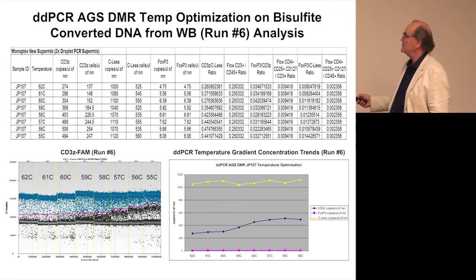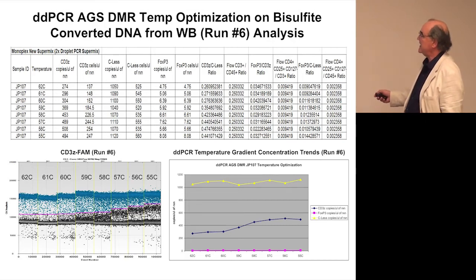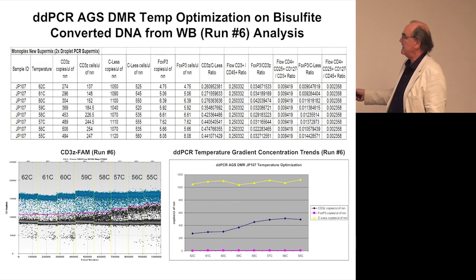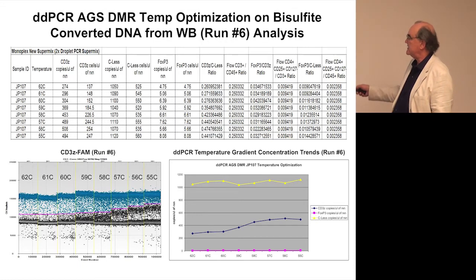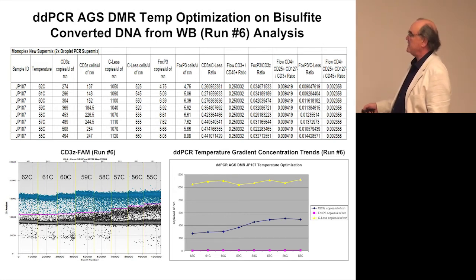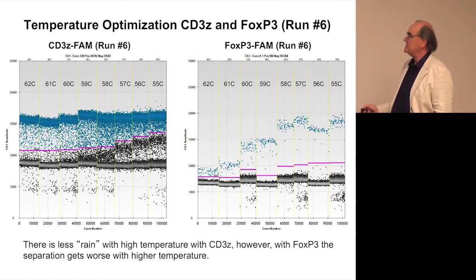One of the things we've done, though, is we've measured the actual T-cell concentrations in this whole blood. And so we're able then to look here. This is actually measured. It's 25% T cells based on flow cytometry and FACS analysis. And so we're able to see that at these lower temperatures, this number creeps way up. So we have sort of an external validation. We can recognize that we should run this reaction at a higher temperature, something like 60 degrees rather than 56 or lower.